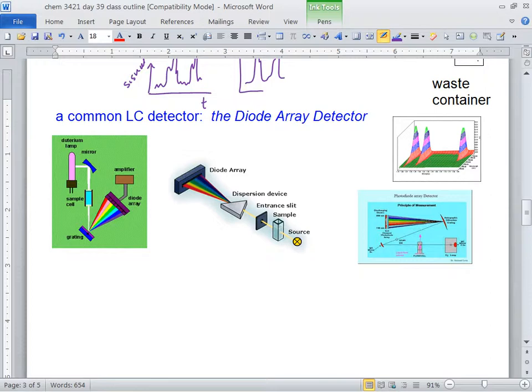But they don't call them solar cells. They call them diodes. And then if you have a bunch of them lined up, they don't call it lined up. They call it, starts with an A, array. Right? So diode array instead of a whole bunch of solar cells lined up. So, see how it sells? These guys know how to make money. Okay? So that's pretty much all that's going on.